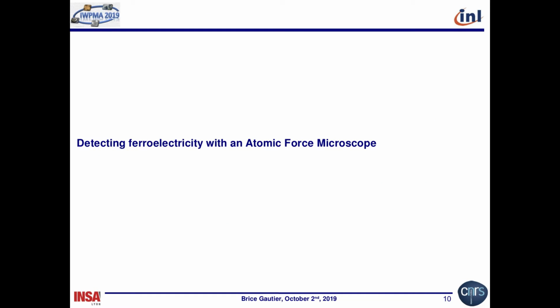So it's better. Now, this is for the fundamentals of atomic force microscopy. Let's switch to piezoresponse force microscopy.